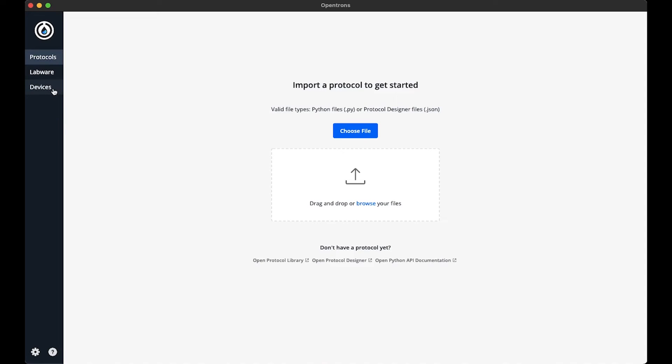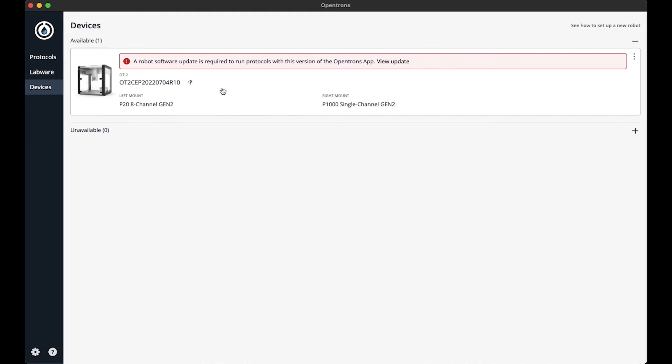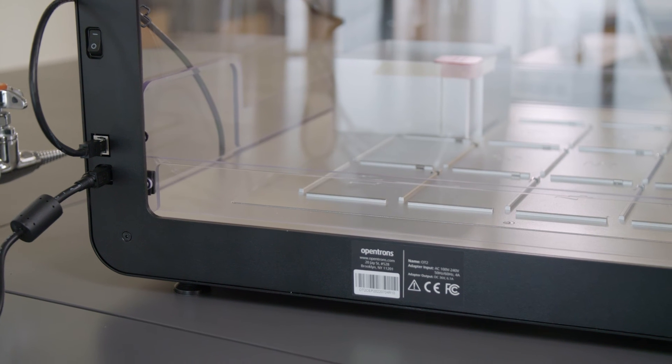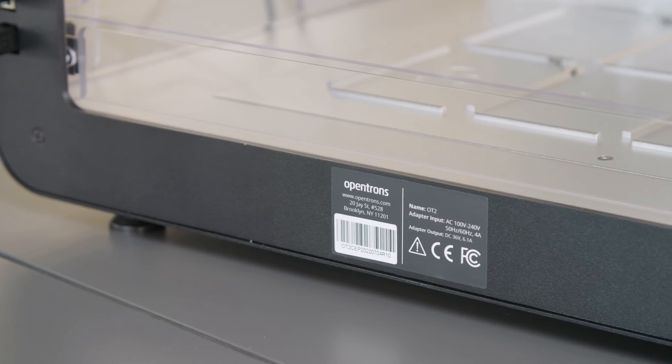I'll navigate to the devices tab, and here it is. The OT2 shows up as the serial number, and you can also find the serial number of the OT2 on a sticker on the side of the machine.